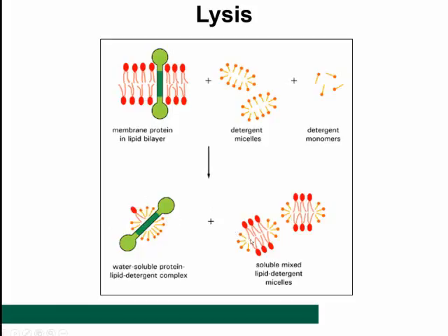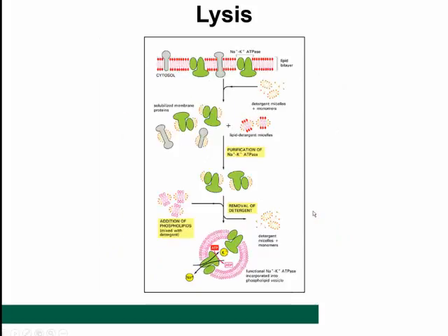denaturation. And then the detergent molecules will combine with the membrane lipid bilayer right here to destroy the integrity of the lipid bilayer. So when you add the detergent, it will tease out the protein and it will destroy the lipid bilayer right here. And that's how detergents work.